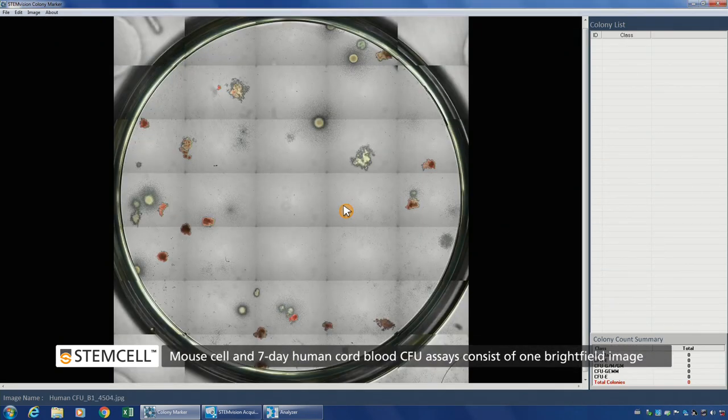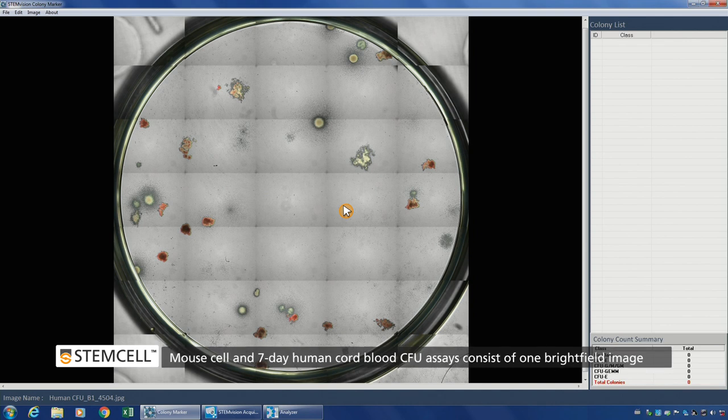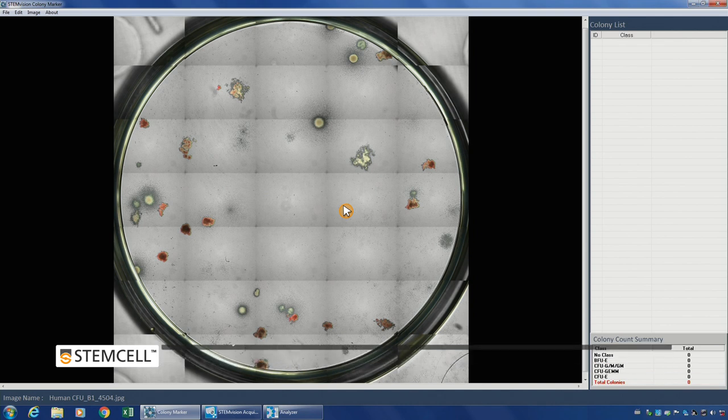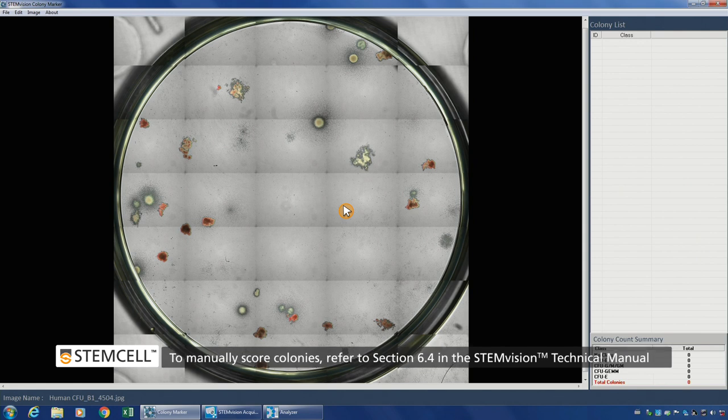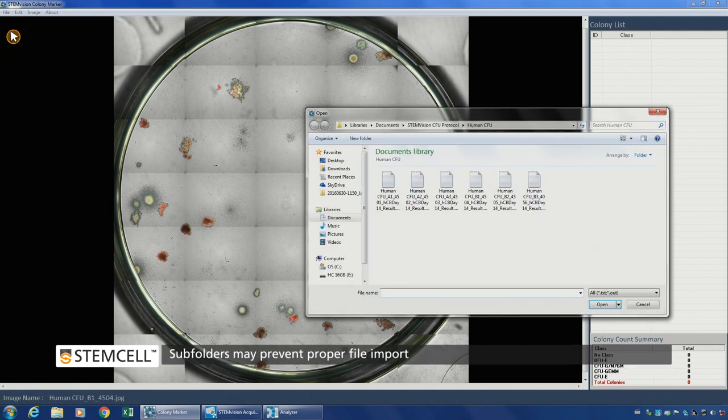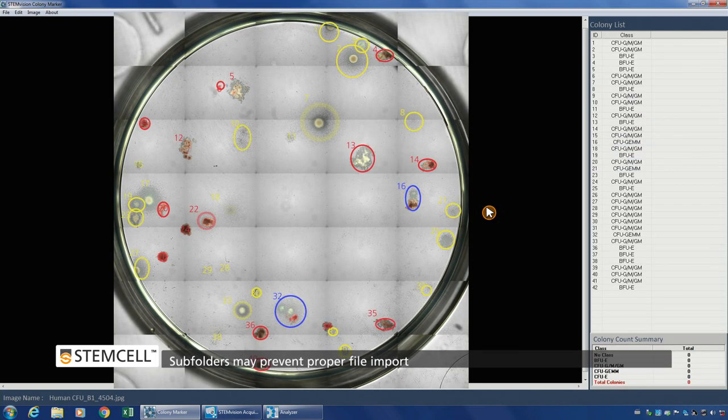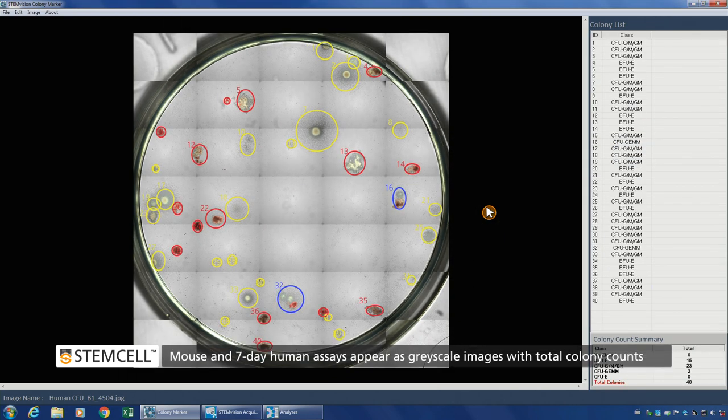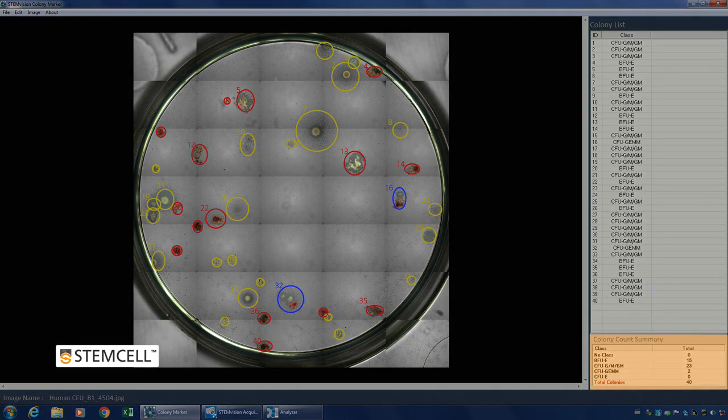CFU assays of mouse cells and 7-day human cord blood assays will consist of a single bright field image only. To view STEM Vision's classification of colonies after image analysis with the analyzer software, load data onto the image. Click File, Open Data, and select the corresponding text file for the sample. The specific subtype classification assigned by STEM Vision will be indicated by a colored circle around each counted colony and also summarized in the data table on the bottom right.